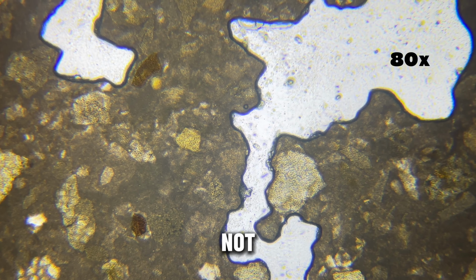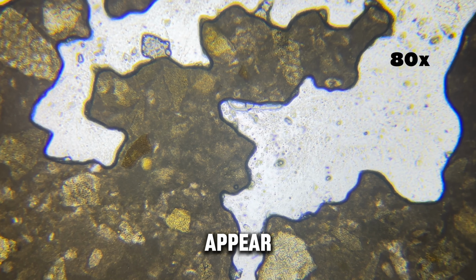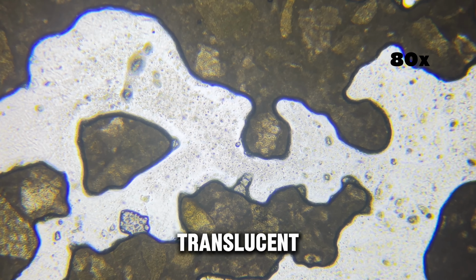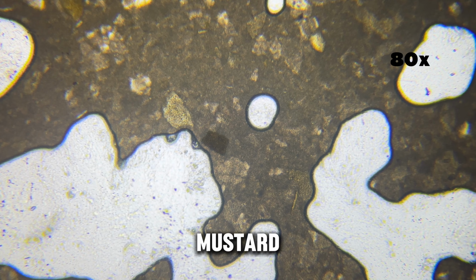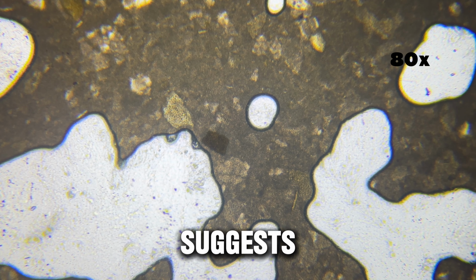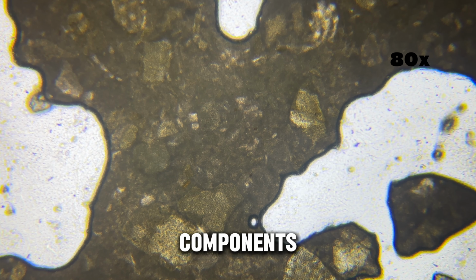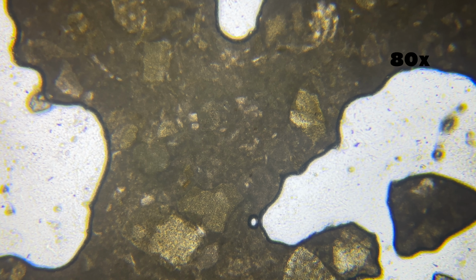The color is not uniform. Some areas appear darker and heavier, while others look lighter and more translucent. The edges of the mustard are uneven and organic. They curve, bend, and taper off, rather than forming sharp lines. This suggests how the paste flows slowly and settles when spread. Clearer zones appear between denser regions. These lighter areas indicate liquid components distributed throughout the mixture.